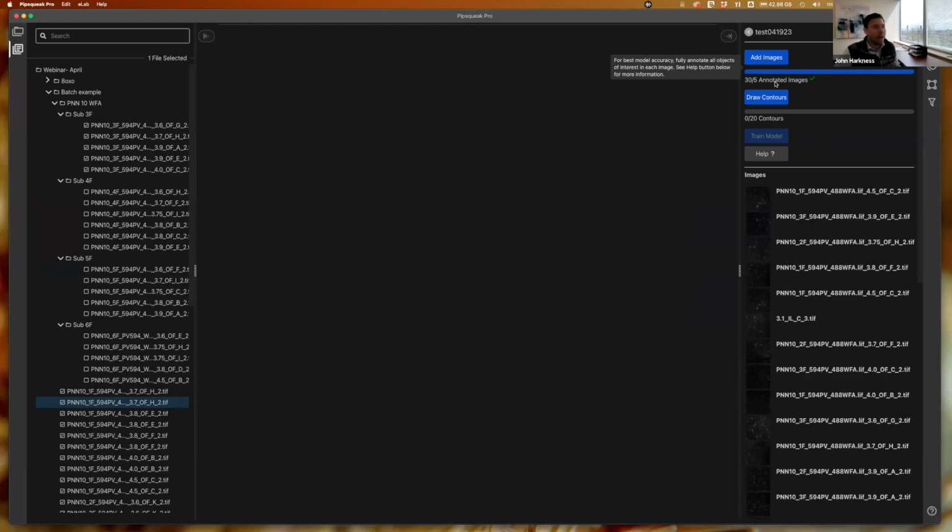So this is great, and this is really going to the point of what we're looking for in model training. We need a minimum of 5 images, but the more examples you show the AI trainer, the better the AI is going to do. Really, these types of deep learning AI models need thousands and thousands of examples to look at. We've created some really fancy tools that essentially take your small data set and learn from that because of some of the stuff it already knows how to do. So, this is a nice way to make it easier for that training. So I've taken at least 30 there.